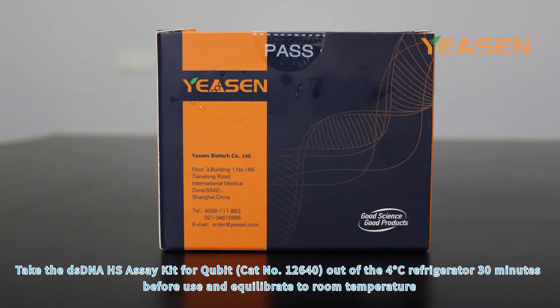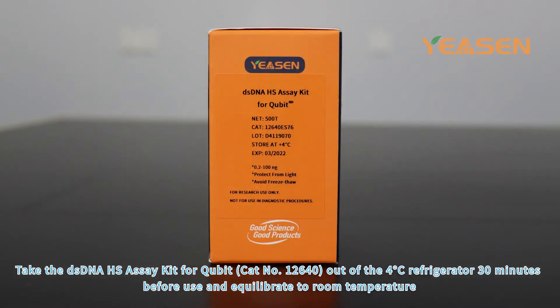Take the DSDNA HS Assay Kit for Qubit, CAT number 12640, out of the 4 degrees Celsius refrigerator 30 minutes before use and equilibrate to room temperature.